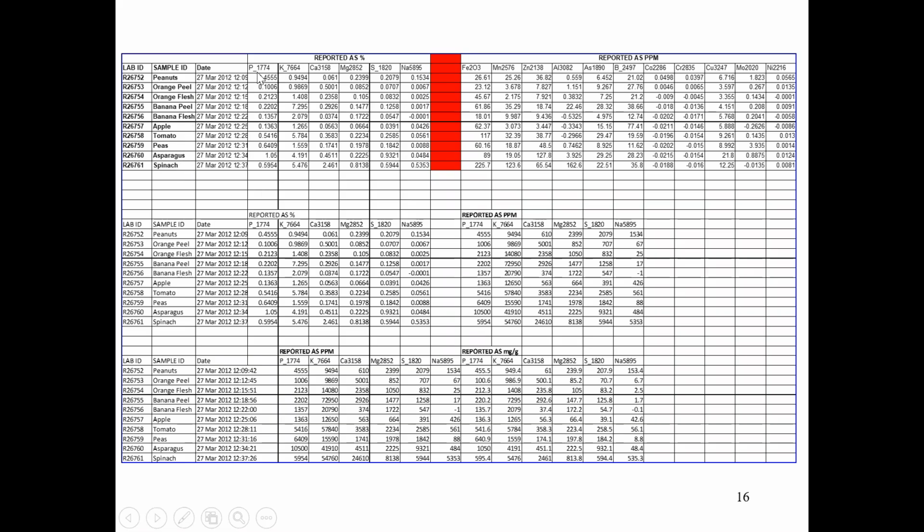And notice here, this is ICP-OES, optical emission spectroscopy, in the soils lab. So we did that. You can see the date is even there. I was looking at this data and said, wow, I did this many years ago. 2012. So that was March, and I continued doing this, and up to some time other students came and did this work. So this is only a sample. I only took a sample.